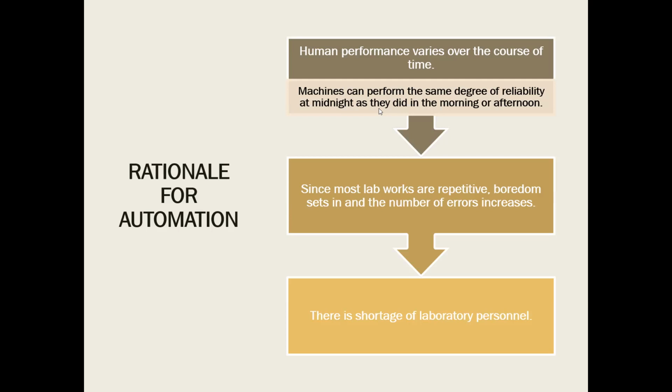However, machines can perform the same degree of reliability at midnight as they did in the morning or afternoon. Kasi sa gabi, medyo inaantok ka na. Di po ba? Sa umaga naman, medyo kagigising mo lang, inaantok ka na din. At saka sa hapon, kapag masyado ka ng maraming nagawa, pagod ka na. Yung machine, kahit po yan ay pagod, gagawin pa rin niya the same reliability and accuracy of the performance, whether sa gabi, sa umaga, or sa hapon.